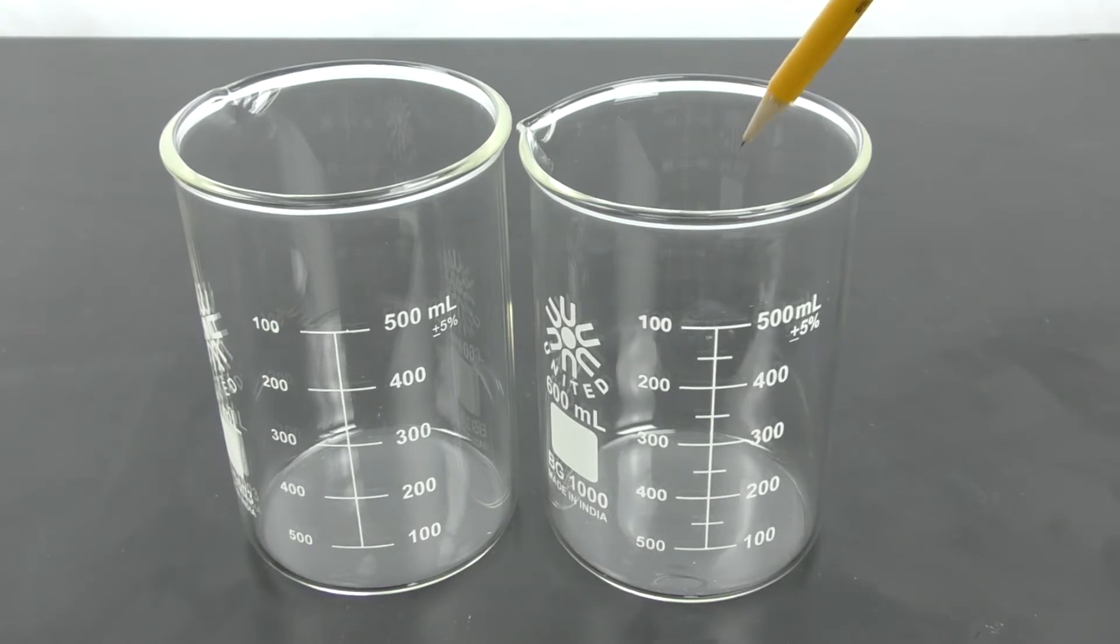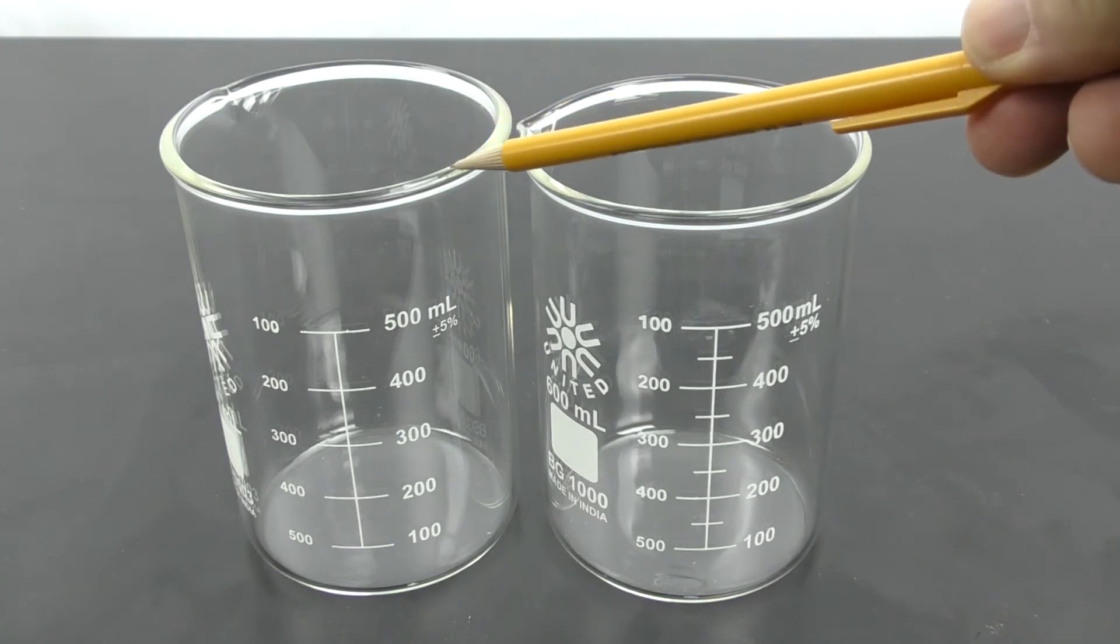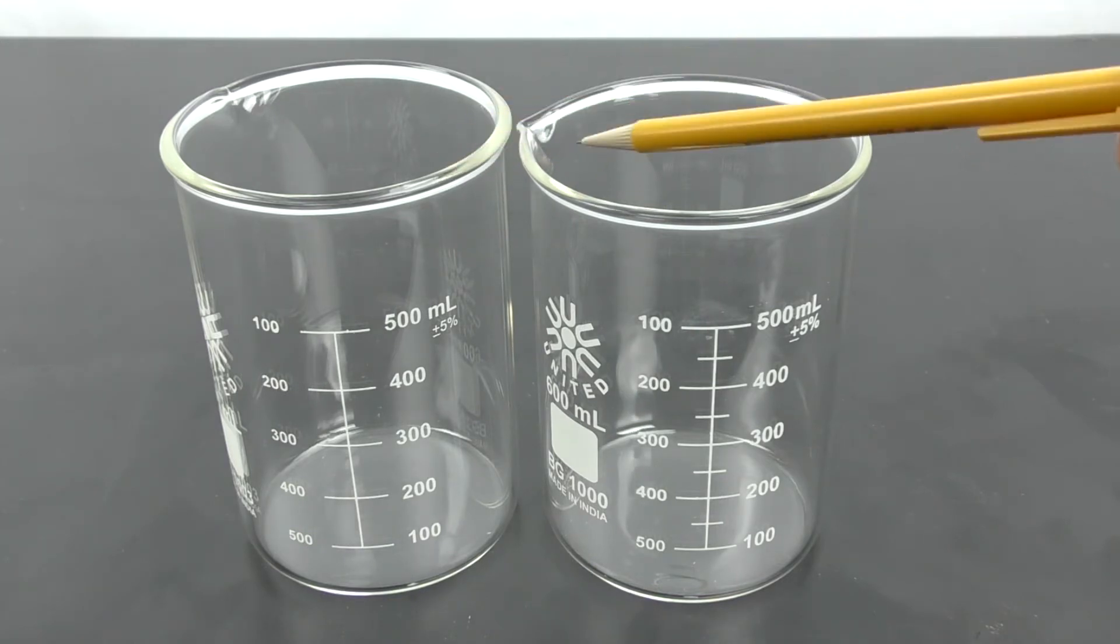Here we have a standard beaker and a heavy duty beaker. You can see right away that there is a thicker wall on the heavy duty and it is slightly taller.